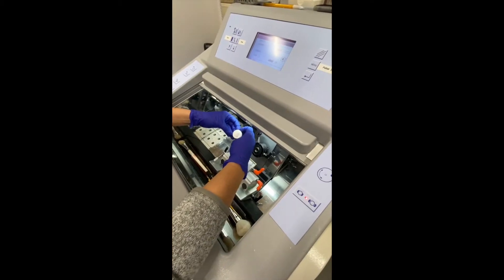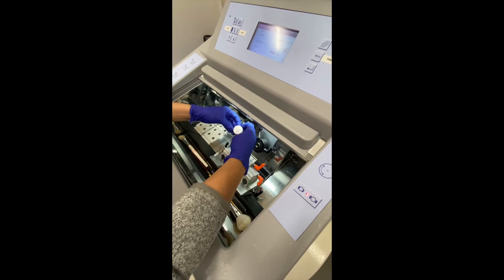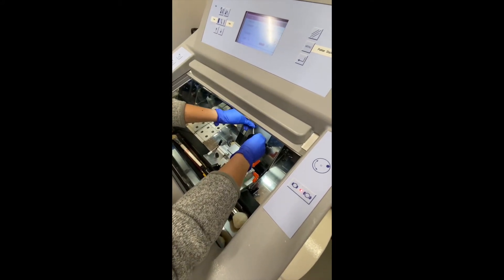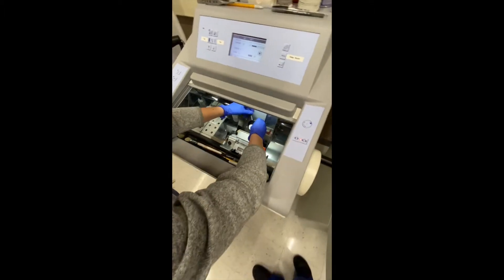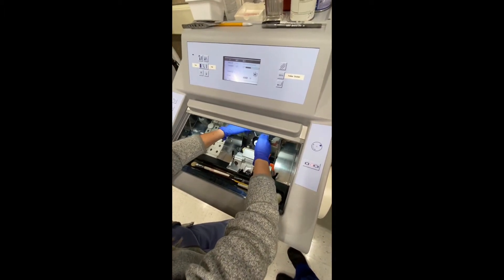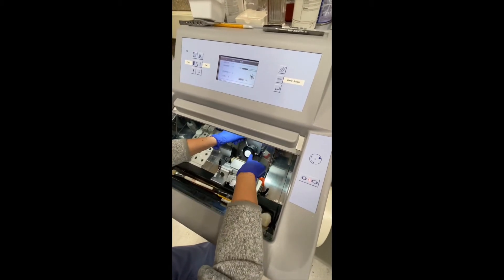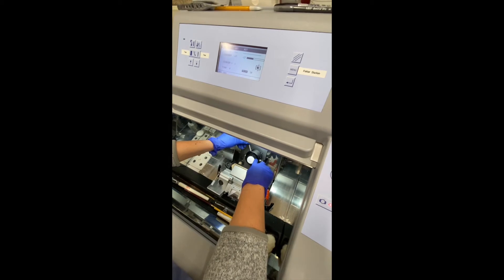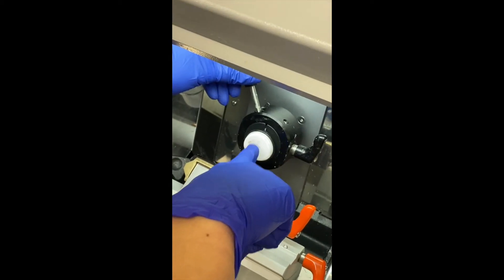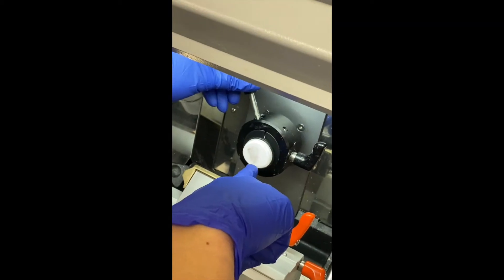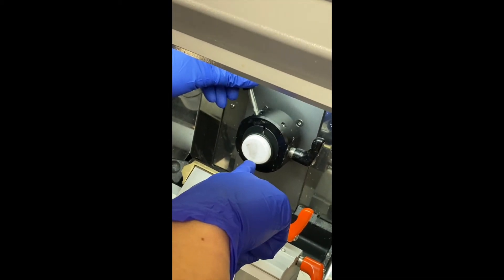After the specimen has been frozen onto the chuck, you're going to mount the chuck onto the specimen head. When mounting your chuck onto the specimen head, you always want to orient your chuck so that you're cutting from either the smallest surface area to the largest, or you're cutting from soft tissue to firm tissue.